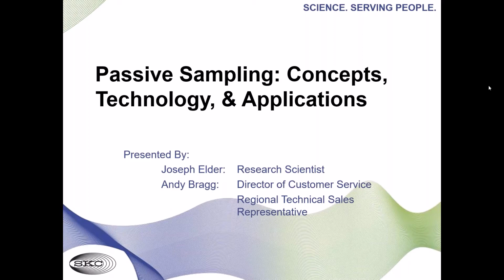During the course of today's 30-minute webinar, our technical experts will share the basics of passive sampling, how to calculate sampling rates, and some information on passive sampling technology available on the market and its applications for IH and OEHS professionals.